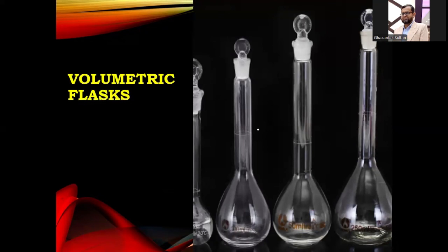And these are the volumetric flasks. We make the standard solution in this volumetric flask because they have high accuracy. Their standard deviation is plus minus 0.01 or 0.1. So these are used for making the standard solution. Sometimes we use these just for keeping the solution.